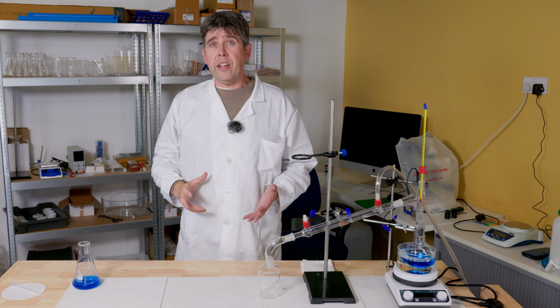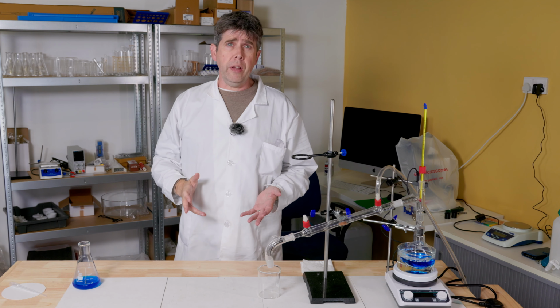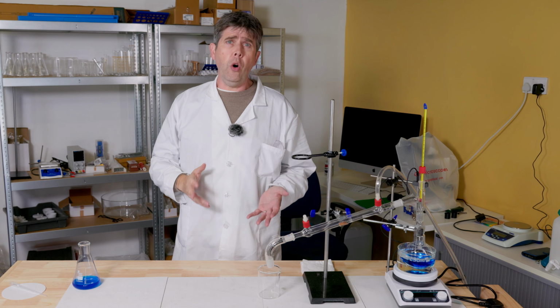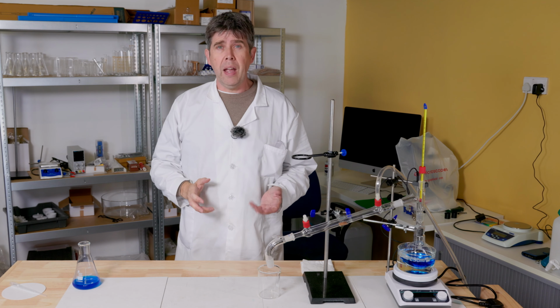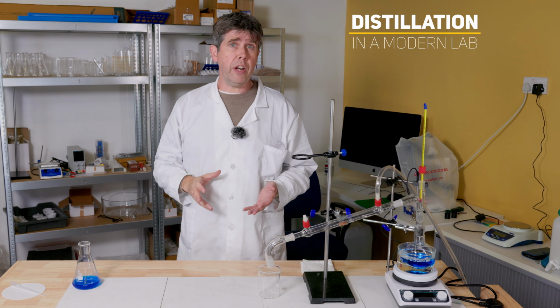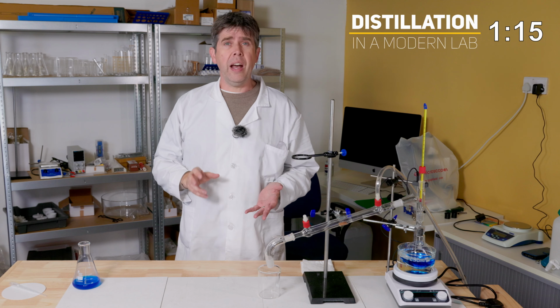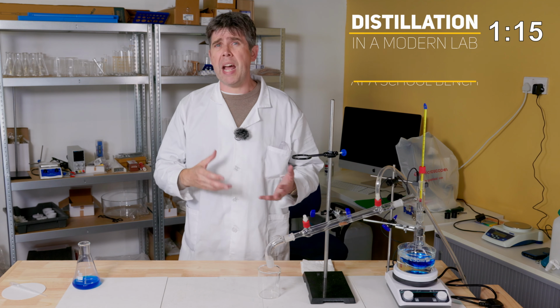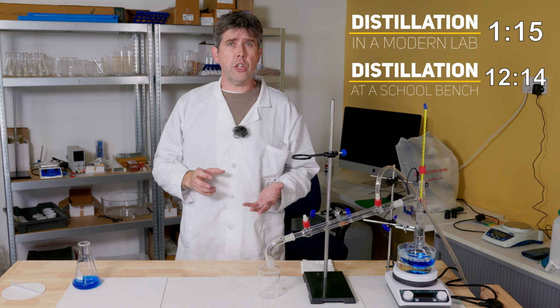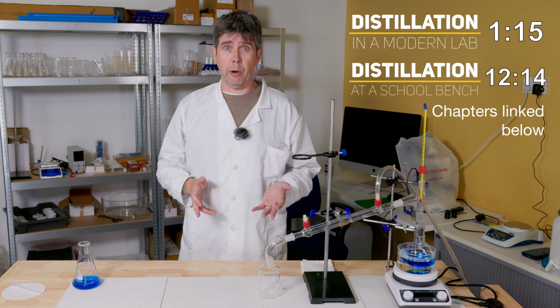Distillation is a technique that allows for the separation of one liquid from either a mixture of liquids or from a solution. I'm going to start off by showing you how distillation is generally done in the lab, and I'll go through the key points of that technique, and then I'll demonstrate a stripped down version of the technique, such as you might be asked to carry out in a GCSE chemistry laboratory.